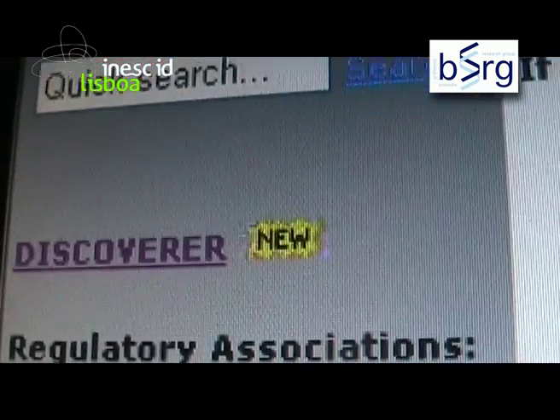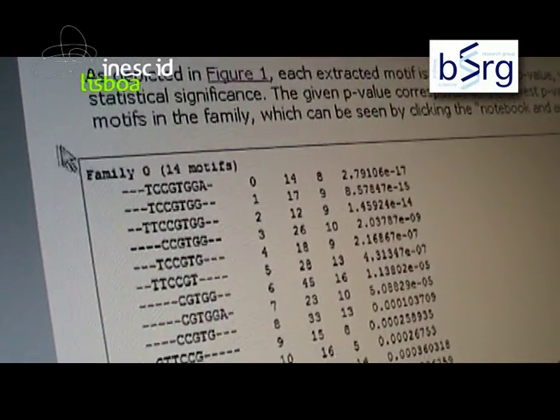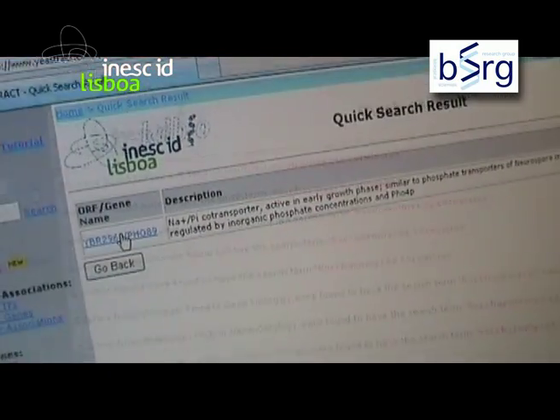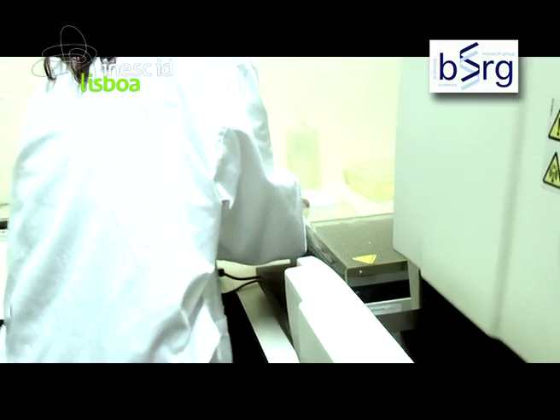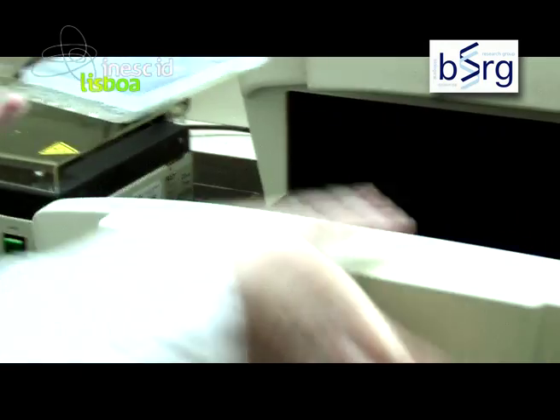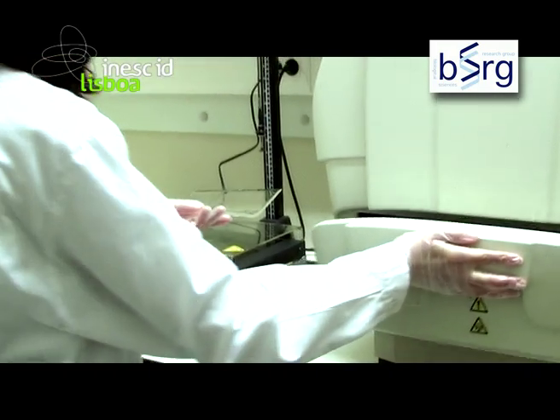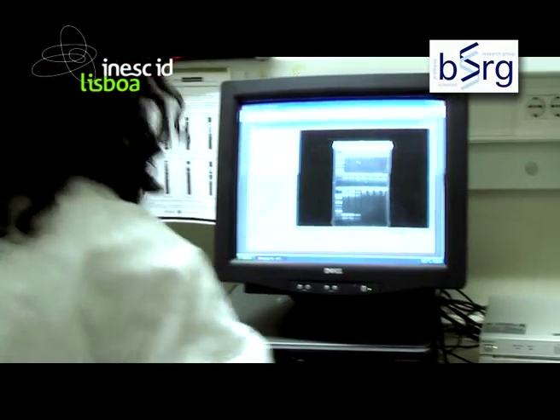E-Strat now includes Discoverer, a set of computational tools that can be used to identify structured motifs found to be over-represented in the promoter regions of co-regulated genes. This system, instrumental in the analysis of complex transcriptional regulatory mechanisms, also provides a set of queries to search and retrieve important biological information from the gathered data, and to predict transcription regulation networks in yeast from data emerging from gene-by-gene analysis or global approaches.